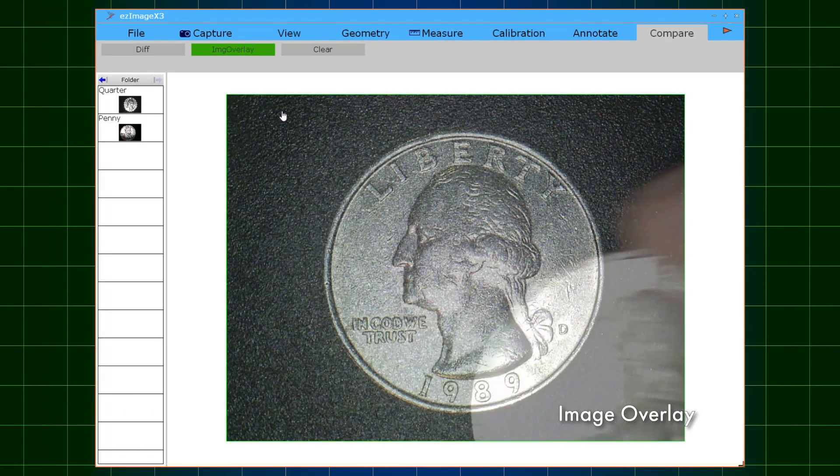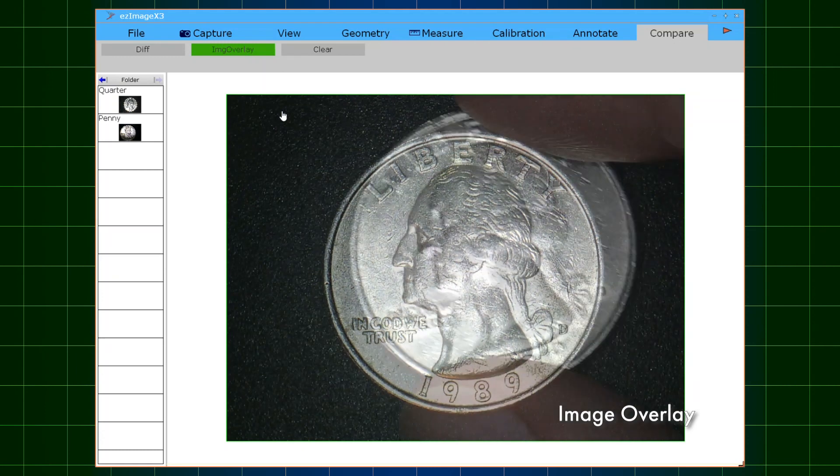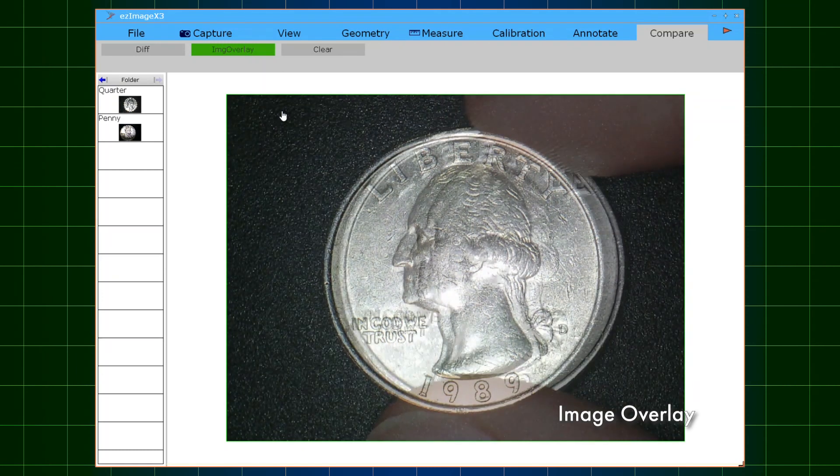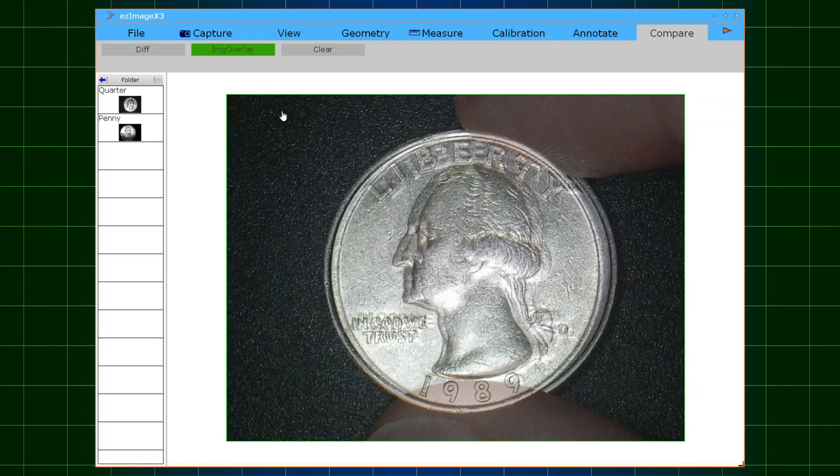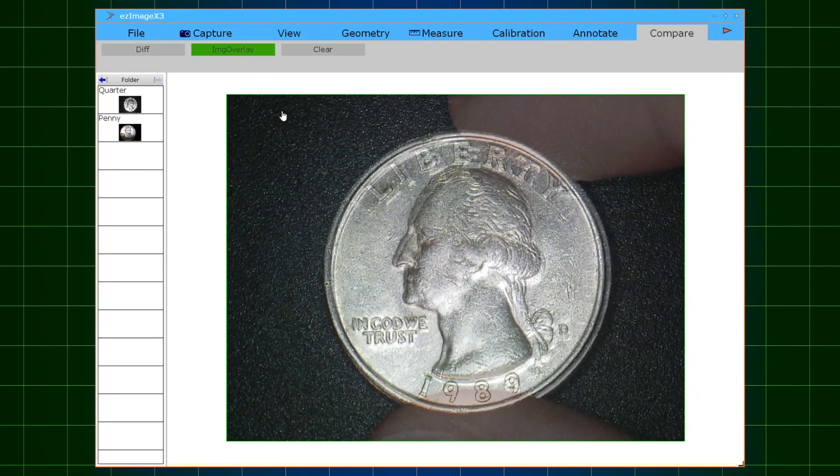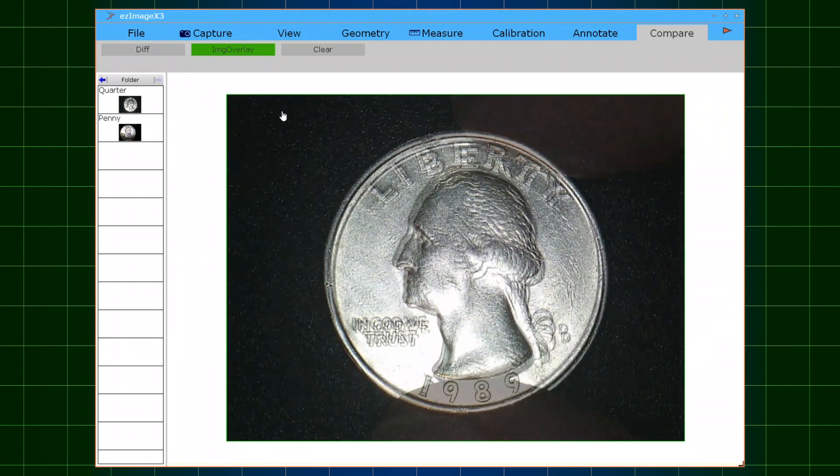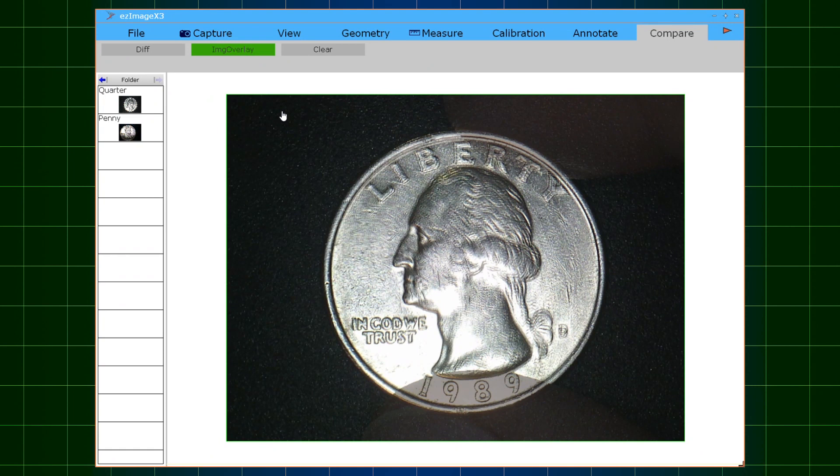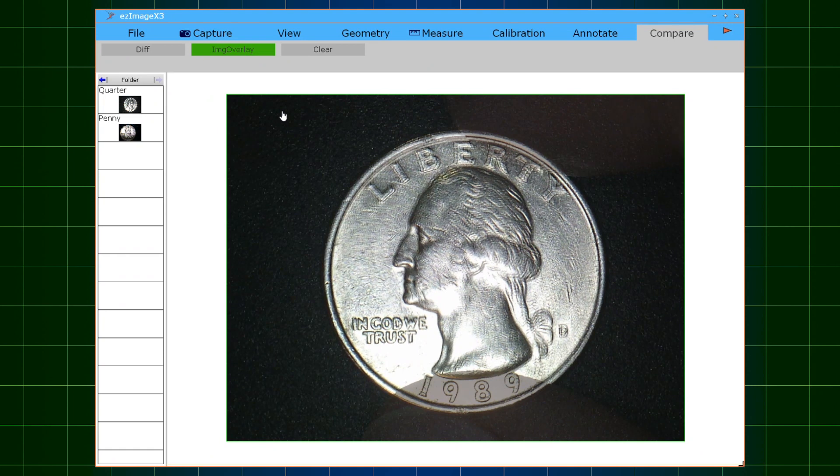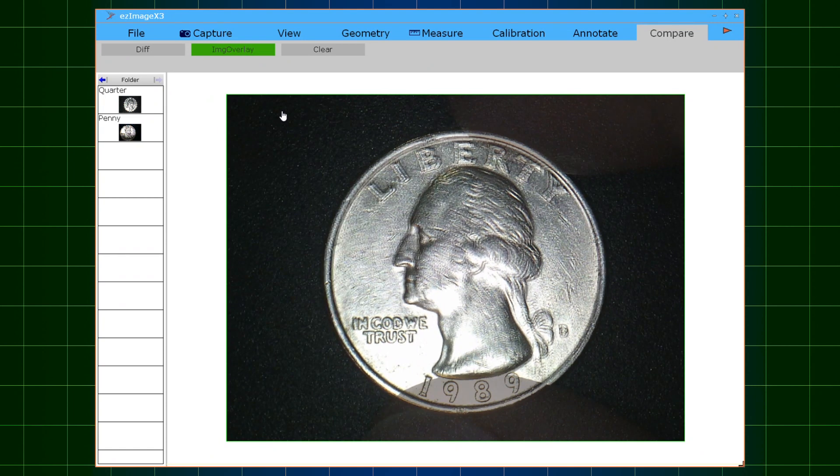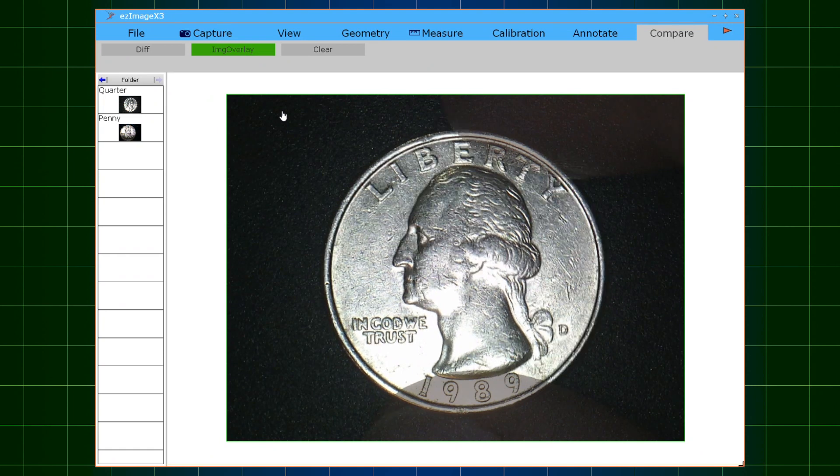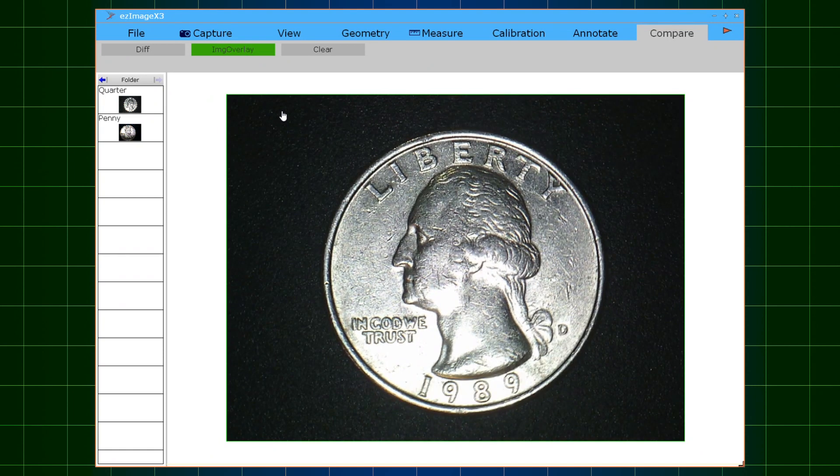Image overlay. Similar to the differential overlay feature, the image overlay function will generate a transparent live video signal above the freeze frame image, also ideal for comparing differences and similarities.